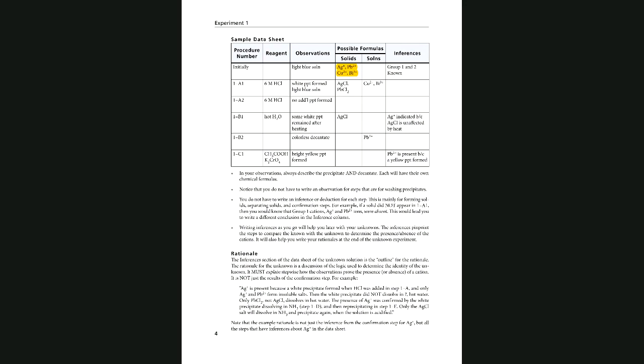So, for example, if you have a precipitate here, it is going to be silver chloride or lead chloride, because copper chloride is not a precipitate in aqueous solution, it dissolves. Or bismuth chloride does not precipitate, so it stays in the aqueous solution form. So when you have a mixture of solid and liquid, you identify which are the possible compounds that are in the solid form or precipitate, and which ones are in the aqueous solution form.